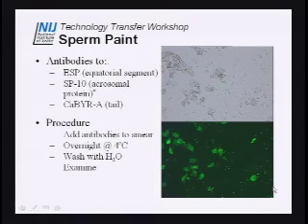Look at the top slide and go in there, and you see, yeah, the sperm are there. They're not too hard to find. That's the easy one. But look at the bottom. Can the people in the back see all those little bright spots? All those are sperm, and all those little bright spots like that are sperm.